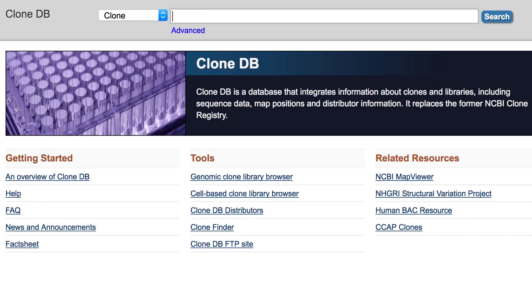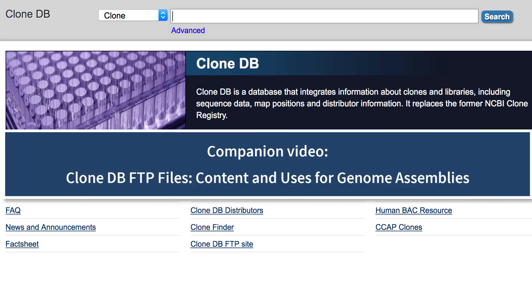The NCBI clone database integrates information about clones and libraries, including sequence data, map positions, and distributor information. This video focuses on clone placement data using three examples. A companion video that focuses on CloneDB FTP content is linked at the end of this video.